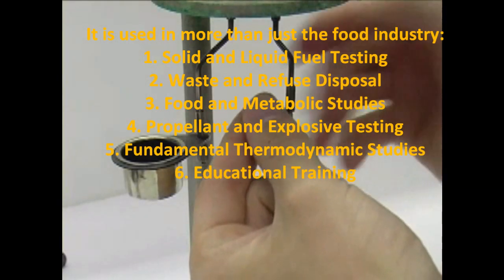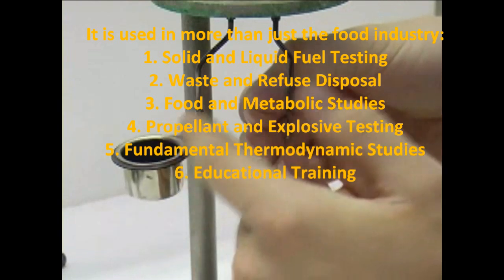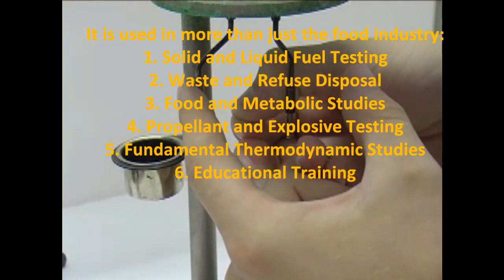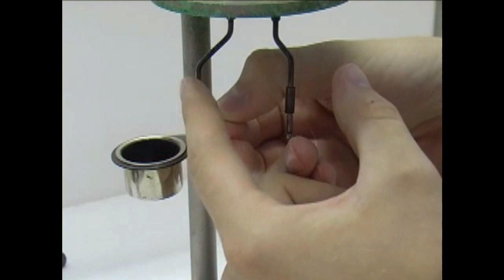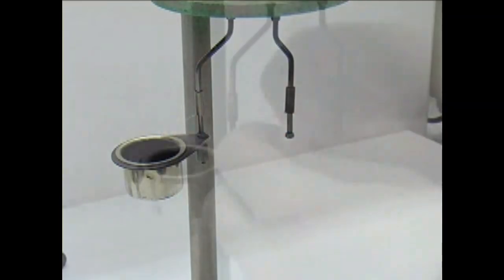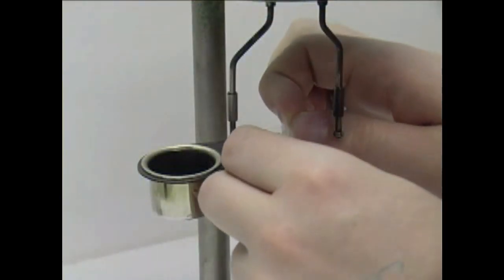The sidearms have sleeves and a fuse wire can be fed through a hole in the sidearms and clamped in place with the sleeves. A piece of cotton is then tied to the fuse wire and fed into the crucible, and the liquid sample then added to the crucible.